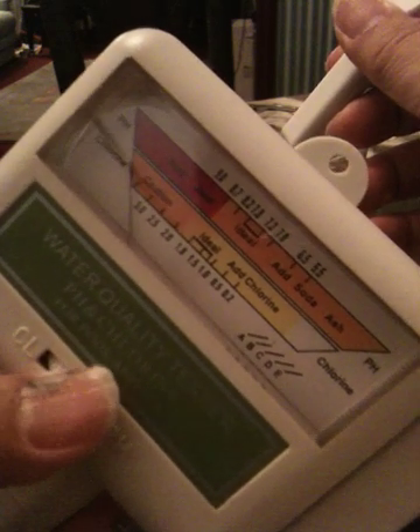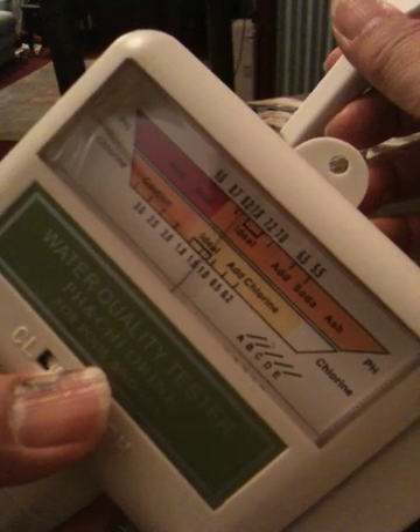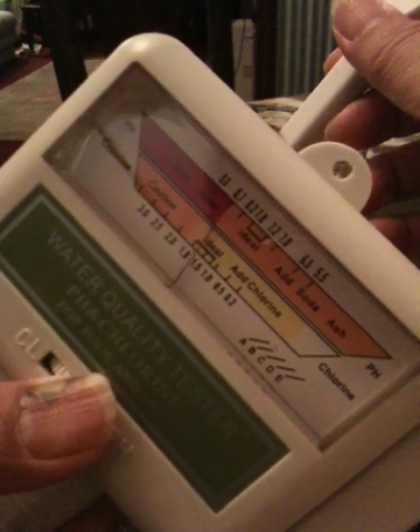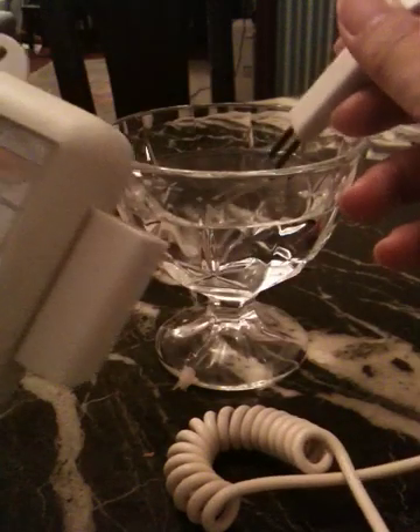Now turn the dial all the way to the left and then move it back until you get the point. It's 1.5 — it's quite close. If you move the probe it will change a little bit, and then you can stop until it will point to the point.